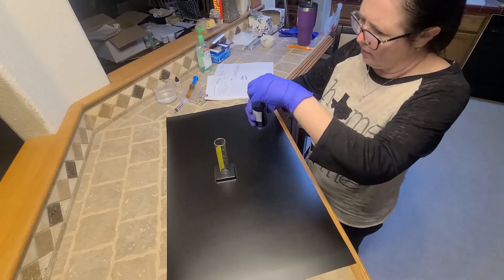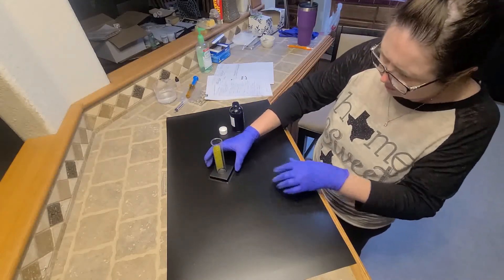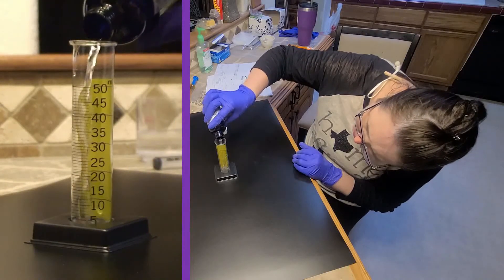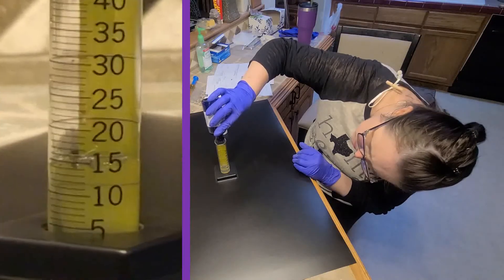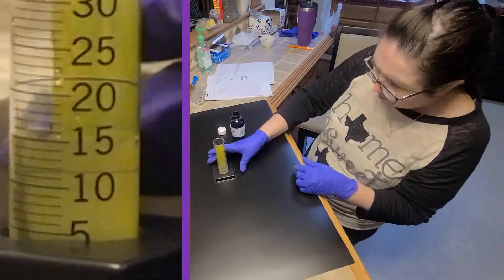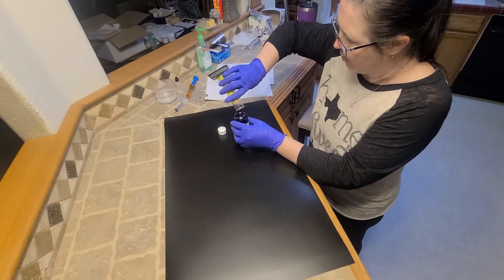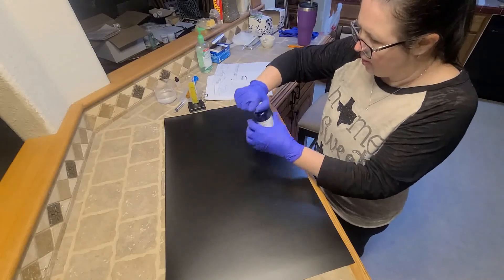I'm going to pour it back in here so we can look and make sure that it's all mixed up together. So it looks really mixed up together — good. Put it back in our bottle and we are going to attach our labels.